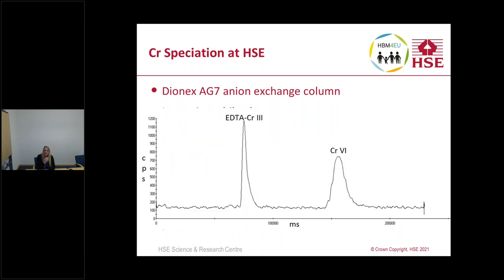So you can just see a chromatogram there of the two separated species. The EDTA complexes with chromium 3 to keep that stable, and the pH adjustment to pH 8 stabilizes chromium 6.